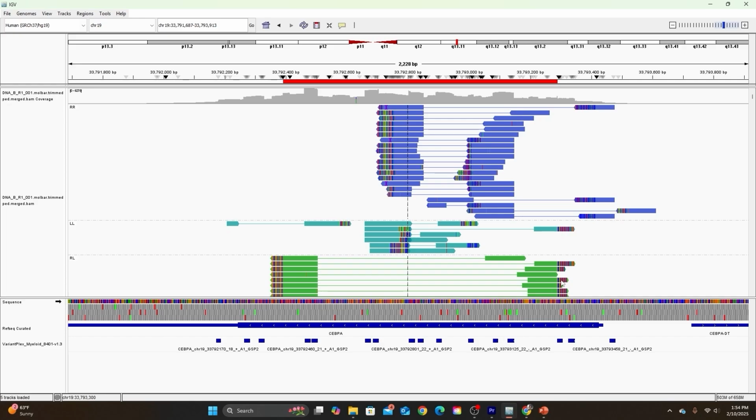And it's really hard to tell with a structural variant of this size what's going on in the middle to fill in those gaps in the data. So it could be that these can help fill in some of those gaps. But like I mentioned, we're not going to fill in all the gaps. We're not going to get the entire sequence for this huge structural variant.